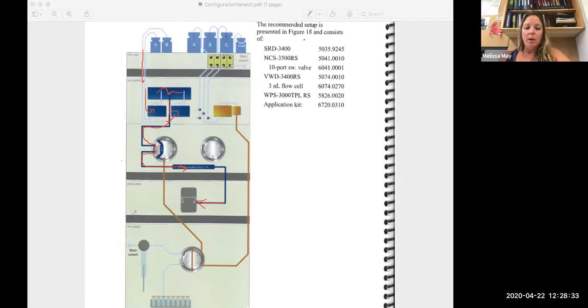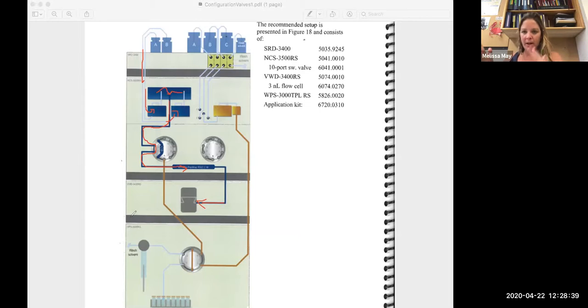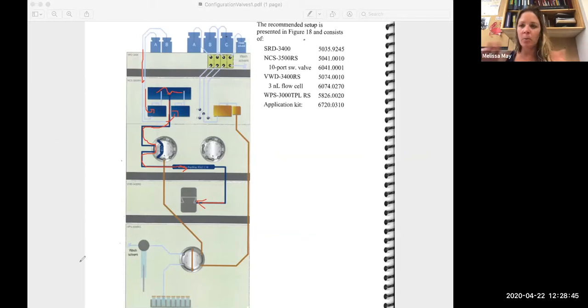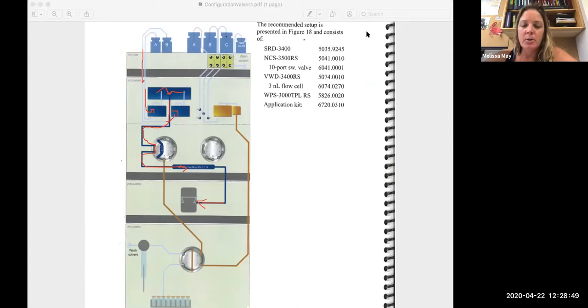When we want to load our sample, we need to change the configurations of these valves. So instead of just pumping stuff to waste and pumping stuff out to the column, we need to make sure all these things are in line with one another.